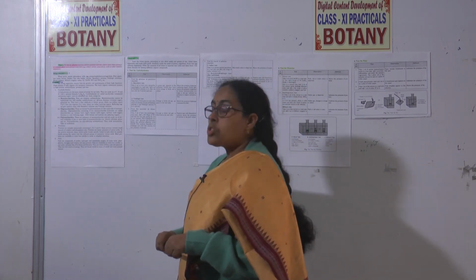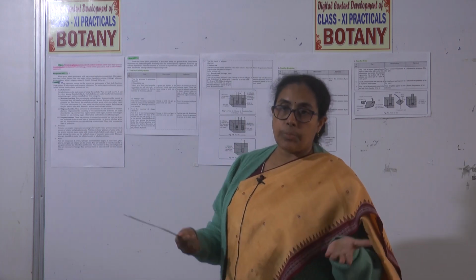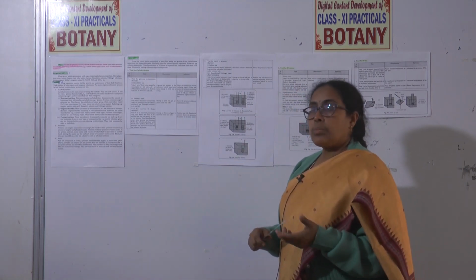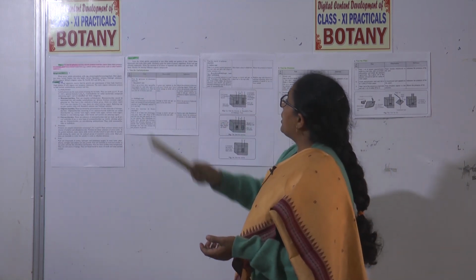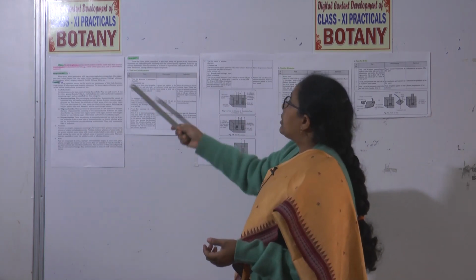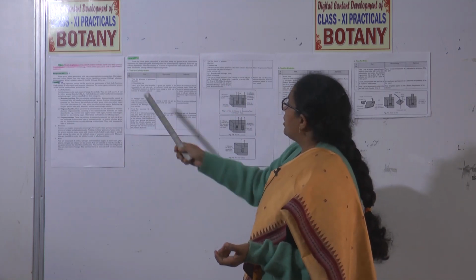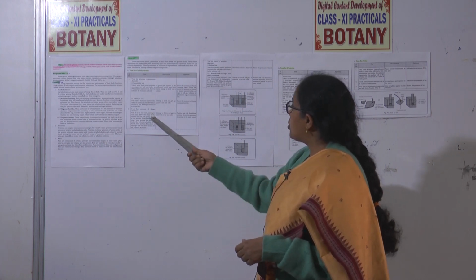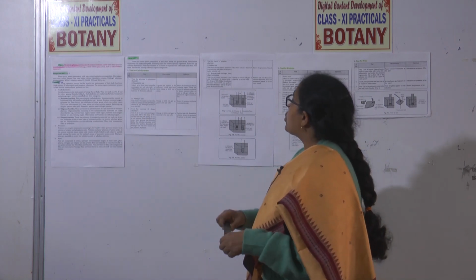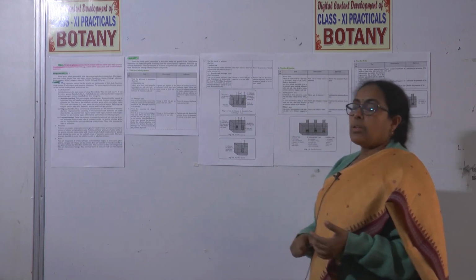So what are the ways you are going to do? Ma'am will explain the method of conducting the tests. I am just explaining how to do it. The first thing is that you will have to test for carbohydrate. You take the material, then there is the test which has been given here. Second is the Fehling's test, which is also done to study the presence of glucose. Then test for sucrose, where the confirmatory test is done by taking the reagent solution.